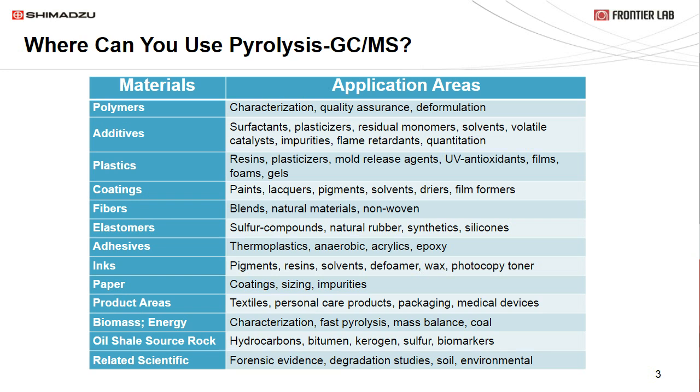For example, additives, plasticizers, surfactants, volatiles, films, and impurities can all be analyzed from a mixture of polymeric samples in many different industries, such as paint, coating, petroleum, plastics, elastomers, microplastics, and consumer products, and that's just to name a few.